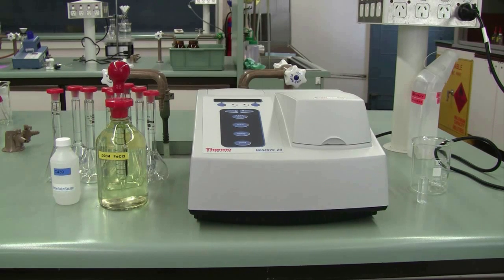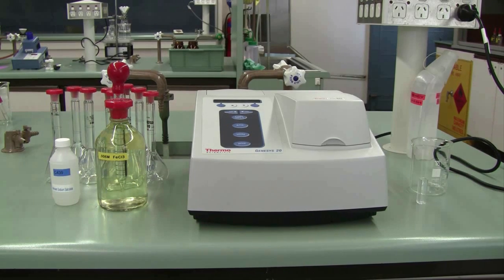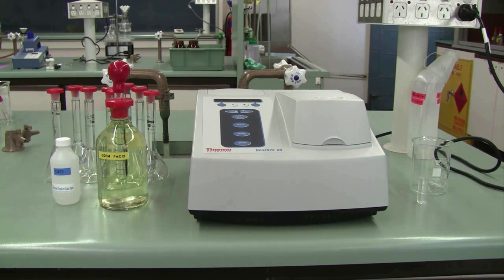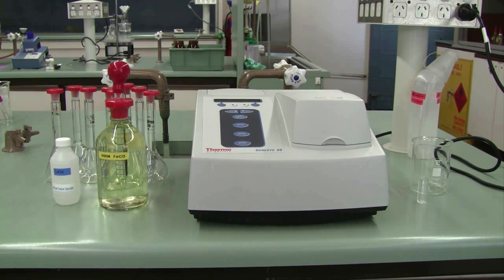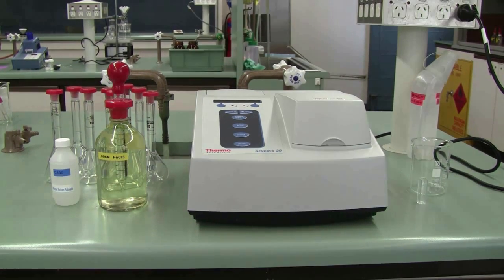So once again, just a reminder: today's experiment is an excellent opportunity to make sure you're as accurate and precise as you possibly can be in the lab. Pay attention to your techniques and if you have any questions about them, make the most of the opportunity. Ask your demonstrators for assistance. Hope you enjoy yourselves.